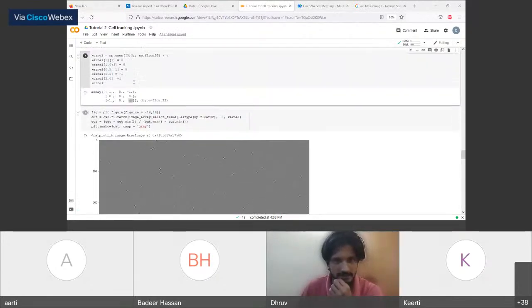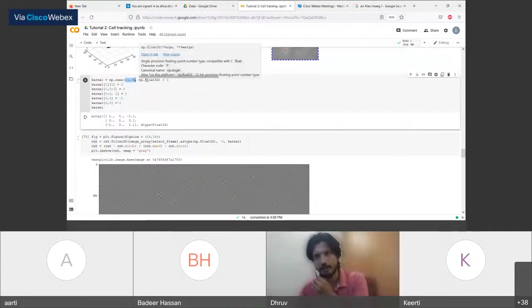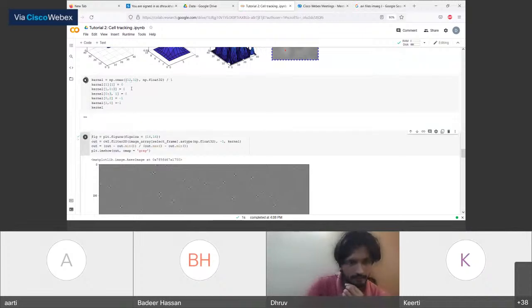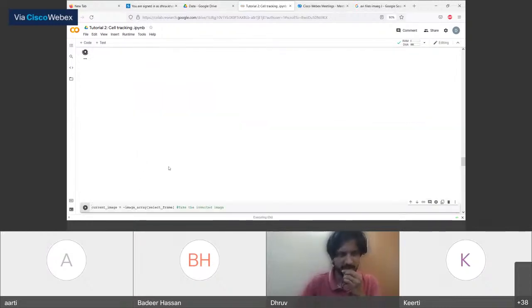This is just an example of a random kernel. Since this is a 3x3 kernel, the effect is very limited. It's only in a 3x3 region. If I designed a big kernel like a 9x9 or a 12x12 filter, I will see that the effect will change dramatically. You can try doing that. Here it won't work very well because most of the values are ones and only a few values are different. So it won't have much difference.